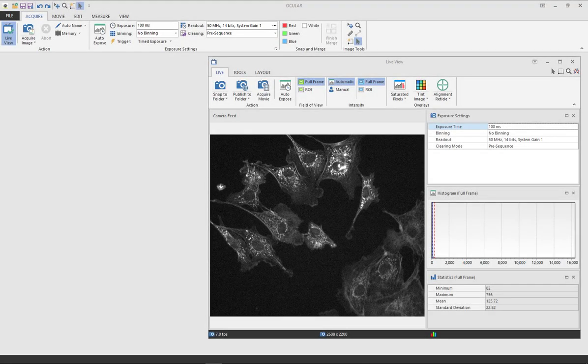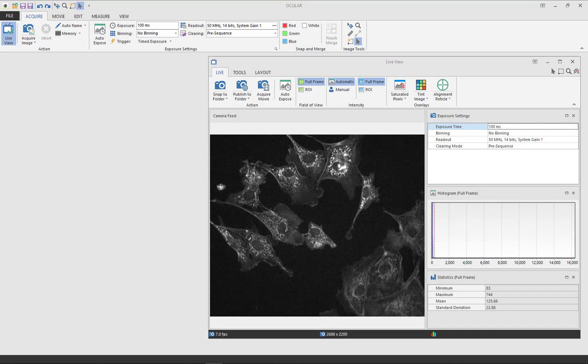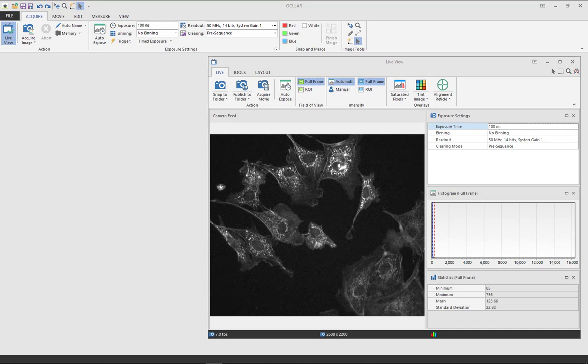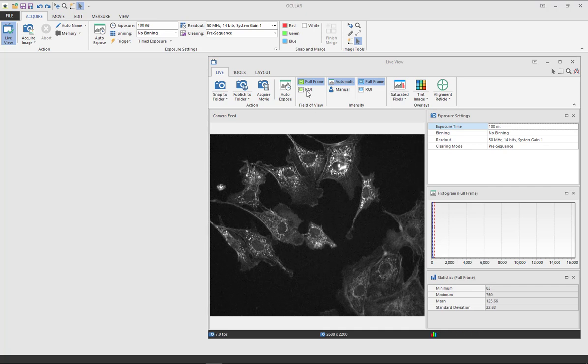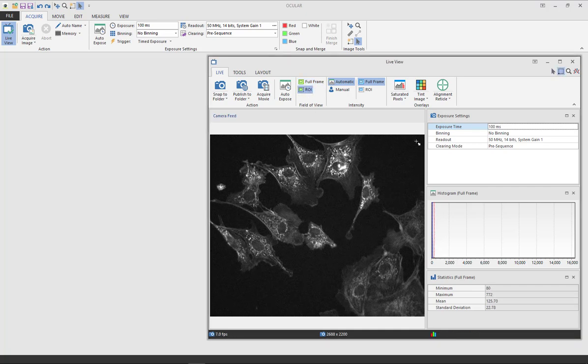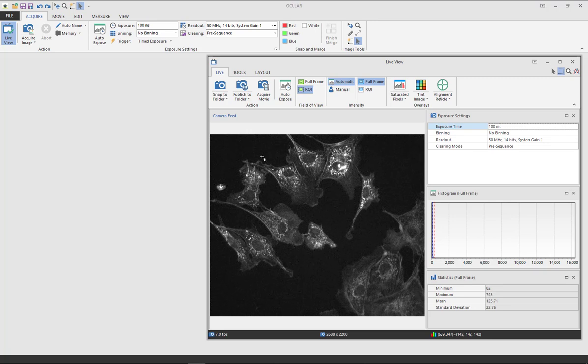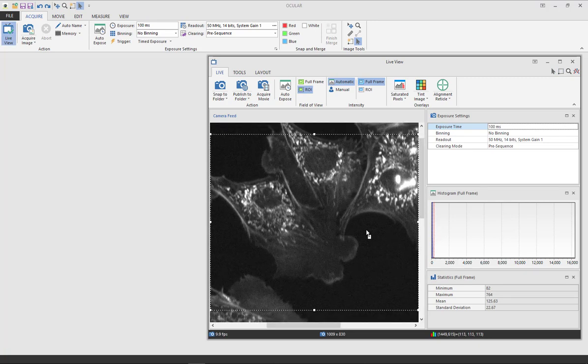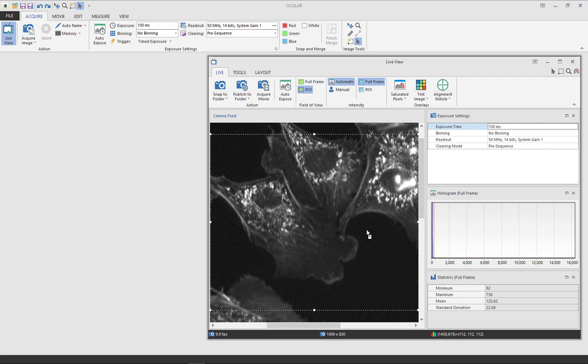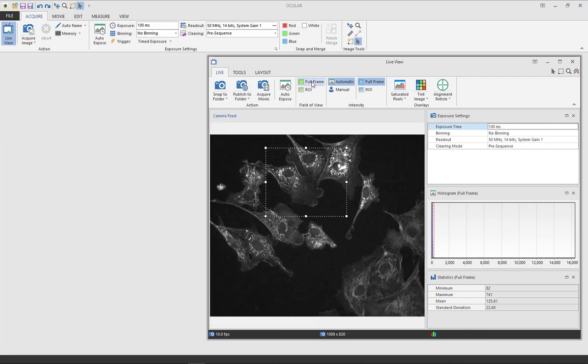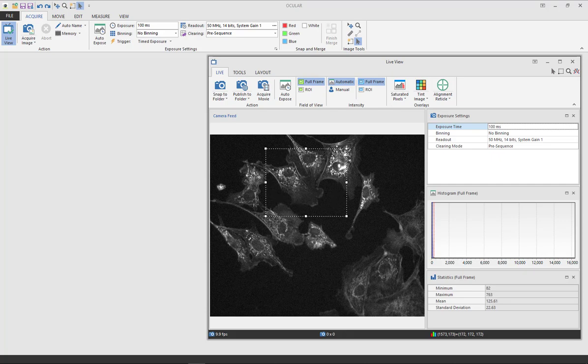You may want to use a region of interest when imaging to focus on one part of your sample or to increase your speed. To do this, select ROI under the field of view tab and the box in the top right hand corner. Then you can select the area that you wish to use. To get out of this, select full frame, get your mouse back, and delete the box.